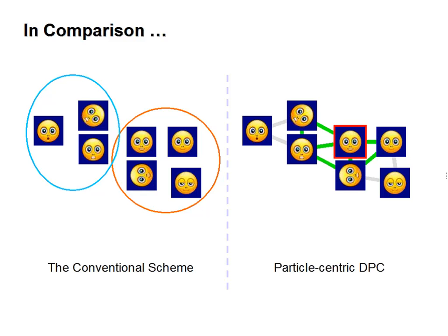So now we have a scoring evaluation. The more dense the edge connection, the better, the more reliable the class is. All right. So this is the basic concept of direct classification. Now let me present to you. So you have 7 classes, and each of them has a score. Yes. And of course, we can come up with an empirical threshold to weed out the poor classes.